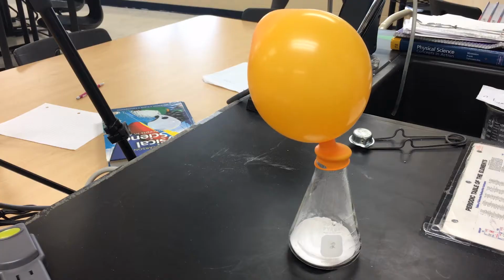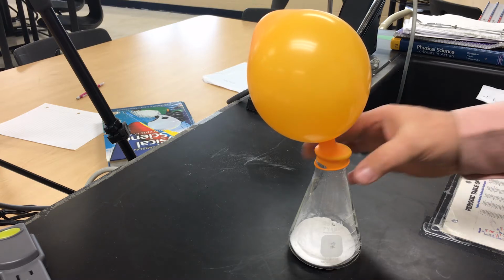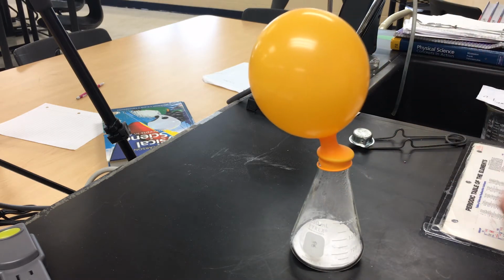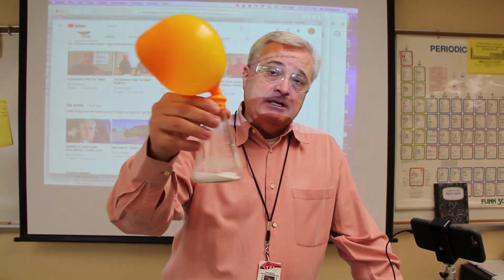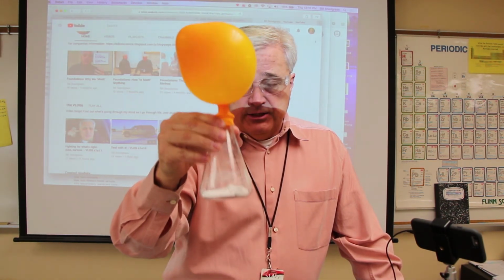So that's it. That's decomposition. It's a really kind of a neat example. So you can see the production of water, and you can see the inflated balloon as the production of the gas, the carbon dioxide. So there it is, and it is cooled down enough now. Obviously, I'm holding it with my fingers. So there you have it.